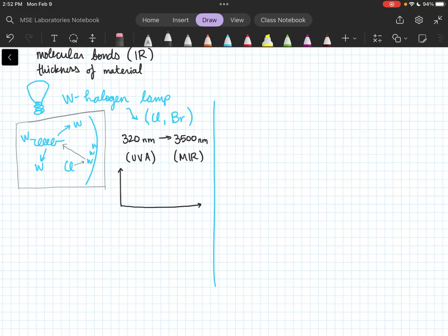And if we were to graph that from 0 to like 3,500 nanometers, you'd see it's really tall and then kind of peters down. It's giving out the most light, so this is like quantity of light. It's giving out a ton of light right around 1,000. And by the way, this is not at all a linear scale of anything. It's hand-drawn. You get what you get.